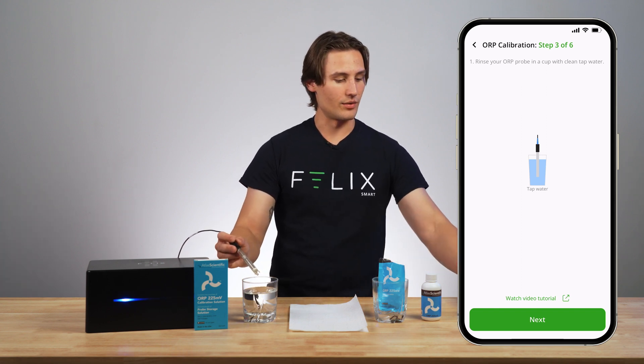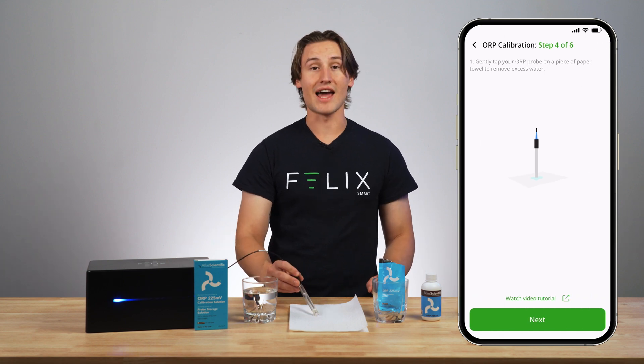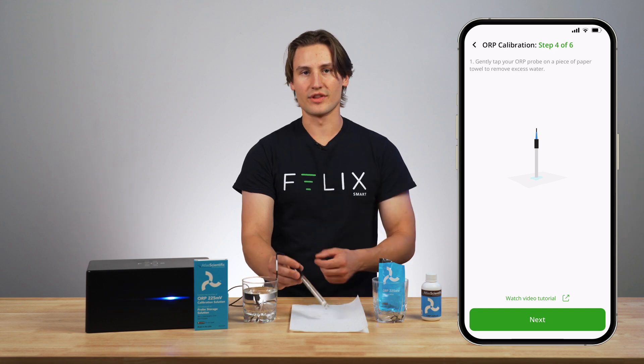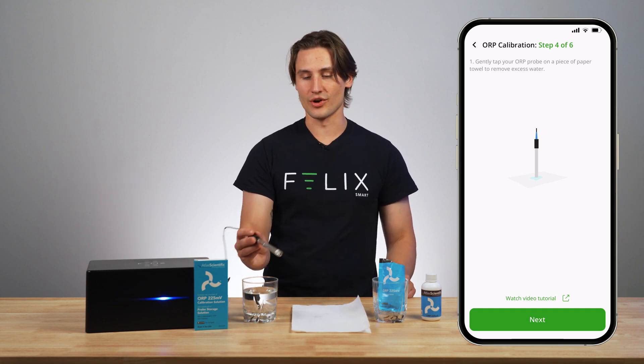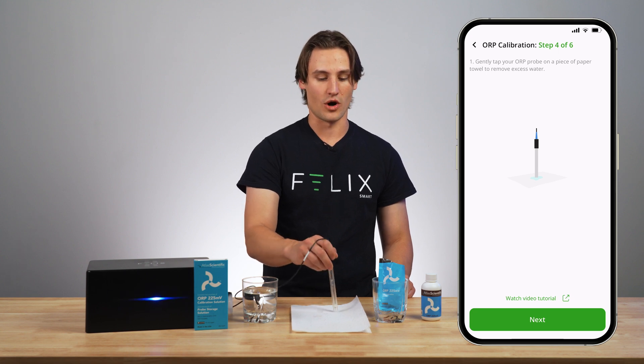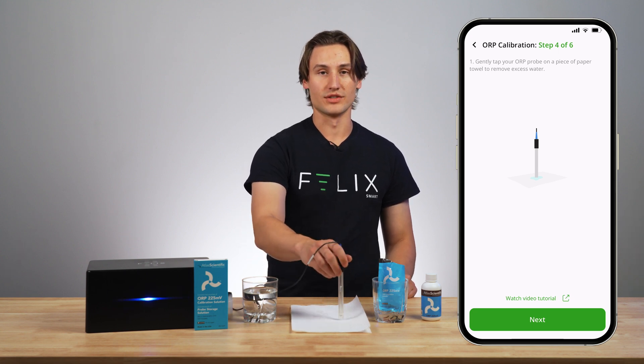I will then click next and I will gently tap my ORP probe on this paper towel. These probes are made of glass so they can be quite fragile, so you don't want to go whacking it anywhere — you just want to lightly tap it, get off any excess water, and then you're able to move on to the next step.